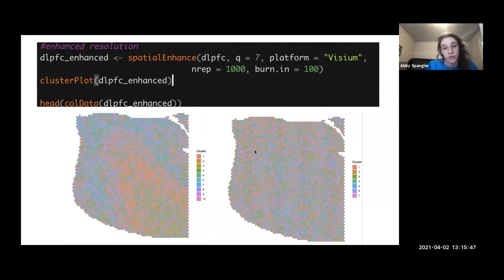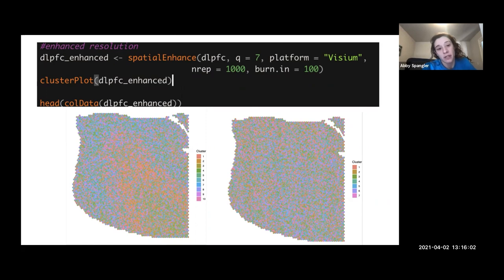And then we move on and do the enhanced clustering again with the same number of clusters. And then you plot it. And I actually tested this out with different numbers of clusters because it wasn't really enhancing our data so much. It sort of confused things a bit more. So I tried it with 10 clusters and then with seven and you can actually, when you go with more clusters, we could see sort of layers starting to form. But with our data, it's a little more confusing.